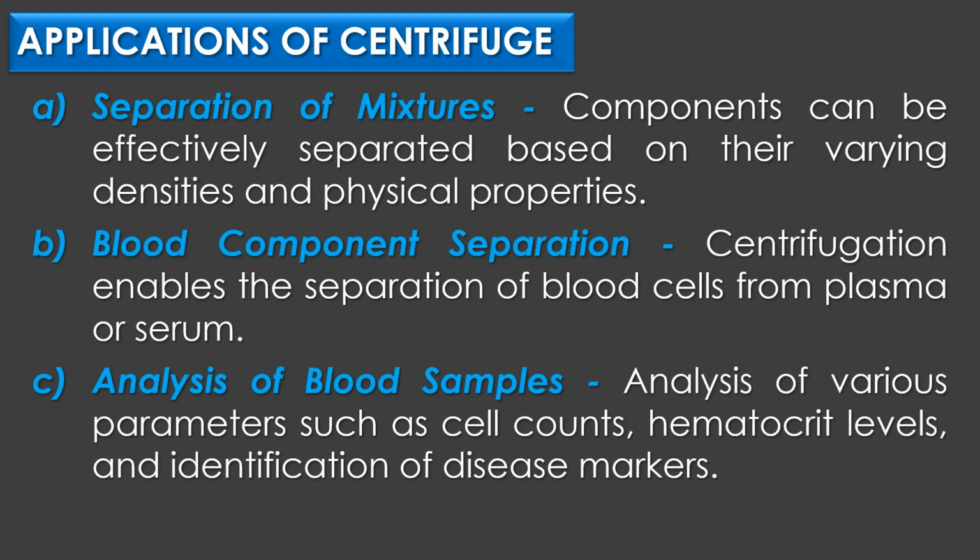Applications of centrifuge. The first application of the centrifuge is separation of mixtures. Centrifuges are widely used for the separation of mixtures containing molecules with similar densities or immiscible liquids. By subjecting the mixture to centrifugal force, the components can be effectively separated based on their varying densities and physical properties.